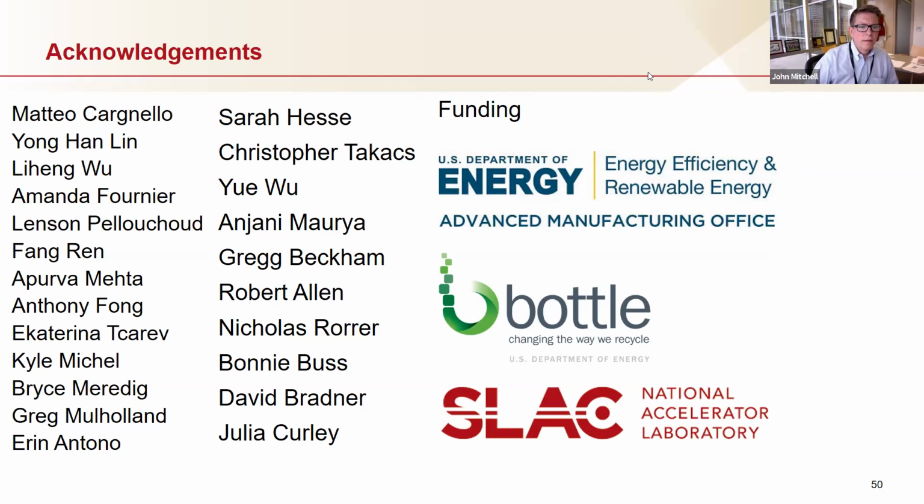Good. Uta? I was a little bit stumbling over your bold thesis that you would like to have 80% of the experiments using autonomous experiment algorithms. I probably said that poorly because I knew I was running over time. What I mean to say is, myself included, there's been a lot of effort by people building one-off demonstrations of these types of things. The most impactful things we could be doing are building the tools that are not as flashy as an autonomous reactor, but that would impact the largest fraction of our user communities. That might be something as straightforward as mail-in powder diffraction that's run by a robot, which many of our facilities have. Yes. How do we optimize the instrument condition in real time based on feedback of the sample?